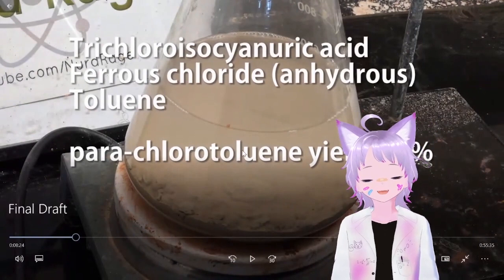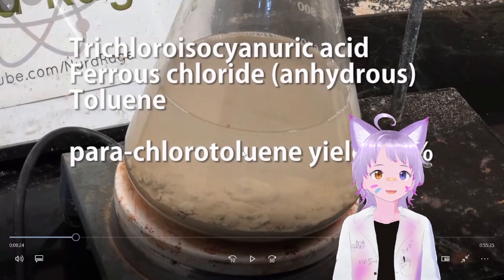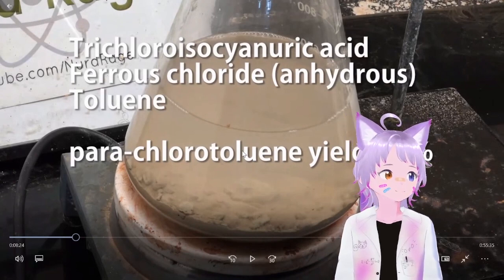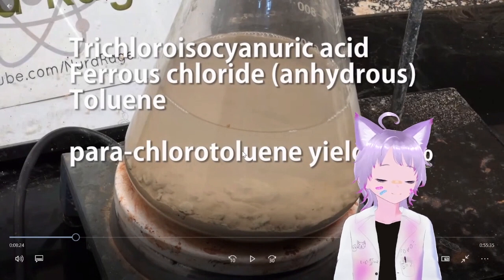I'm just wondering what exactly happens to the ferrous chloride, because I think here it's being used as a reactant given the amount he's got. It reacts directly with the TCCA and probably just forms a whole bunch of, like, crap. So I don't think it's worth recovering. I think it's better just to get more steel wool. Anyway, how much parachlorotoluene do we need?